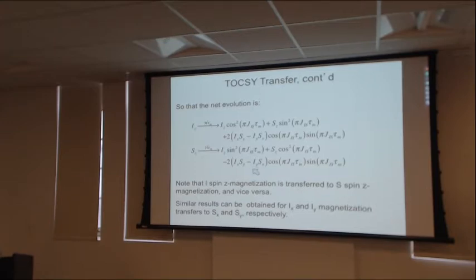What about these guys, these signals? When I apply a 90-degree pulse, we have to worry about what happens to this zero point. So we'll come back to that in a moment.